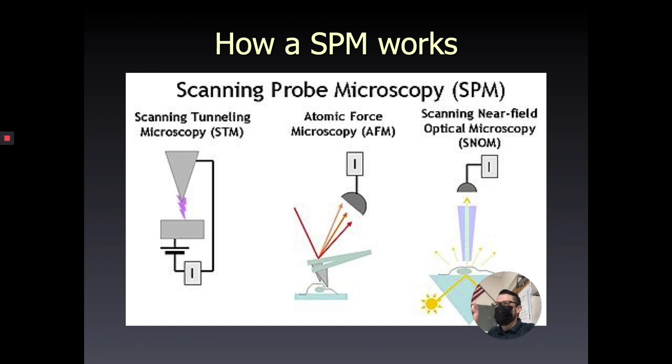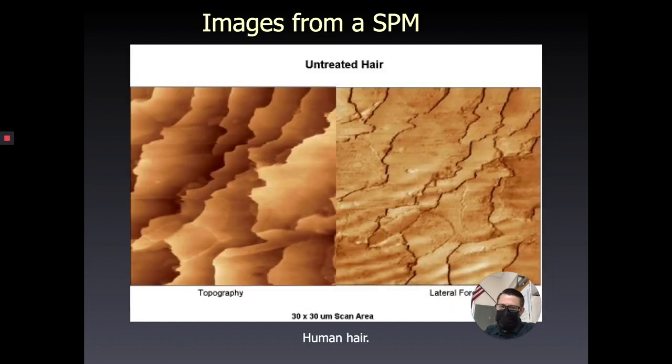So it's kind of like combining an electron microscope and a probe microscope. And then the one on the right here is the scanning near-field optical microscope, or SNOM for short, which I just love that name. What this does is it kind of combines a CLM and a probe microscope, because it shines light through the sample, but that light gets funneled down a very, very thin lens, which is basically a needle-sized lens, and that focuses the light much more intently than a typical CLM or even a confocal microscope can do. So we can see some extreme magnification factors of objects underneath the scanning probe microscope.